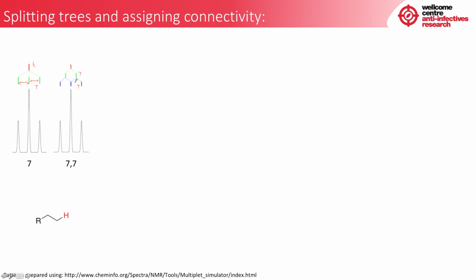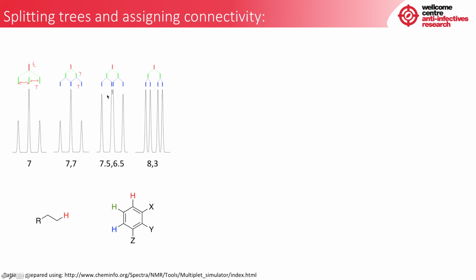To give you an example where the J values are not the same, here we have the central green proton. It has 2 ortho couplings. Here is the small coupling. And if we wanted to find the large doublet here, that would be the center point between these 2 signals that are split from it.